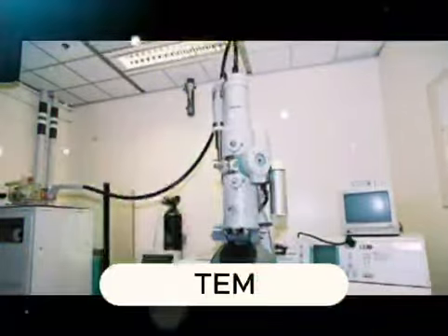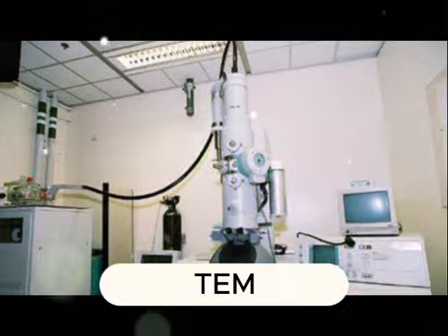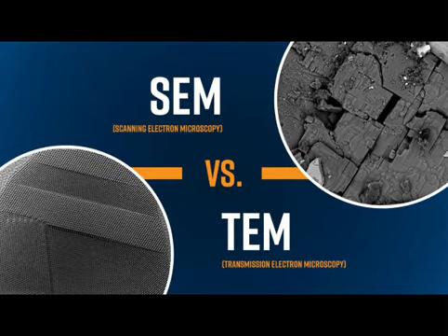TEM, Transmission Electron Microscopy. It shoots electrons through an ultra-thin sample to image it. It gives information about the internal structure, atomic lattice, particle size and defects. SEM sees the surface while TEM sees the inside of the particles.